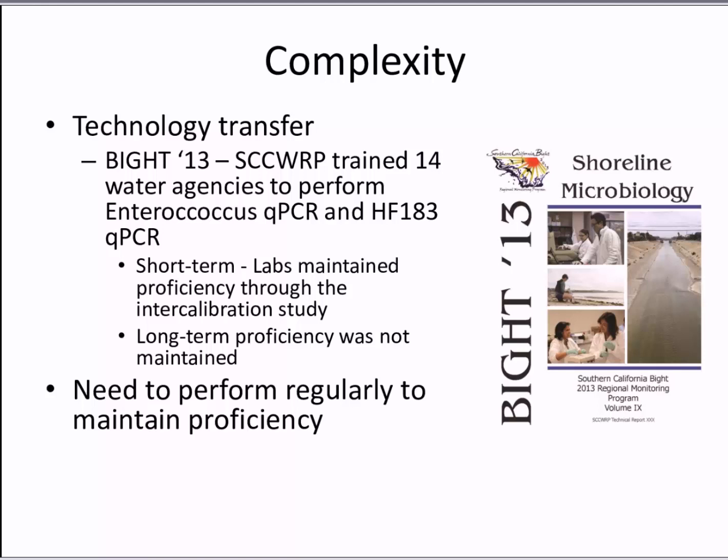So they got the original training and were running it routinely in 2013, but when they went to process the samples in 2015, 2016, the study showed that the labs didn't always maintain their proficiency. So if you're not routinely performing the molecular methods, then it's really difficult to maintain proficiency.